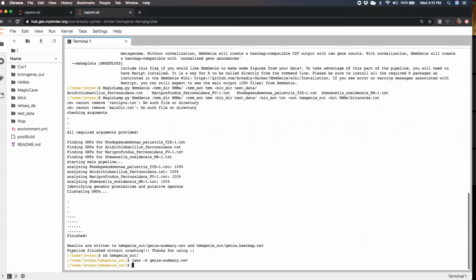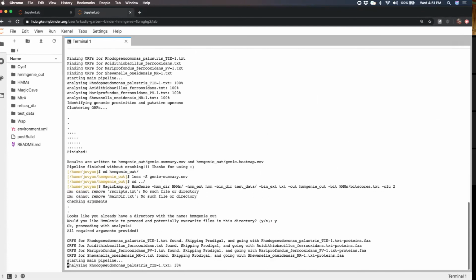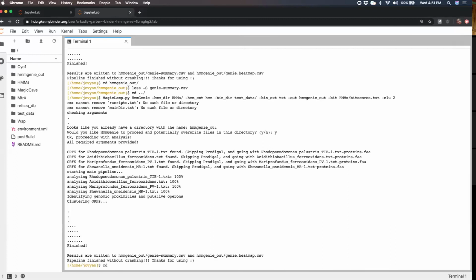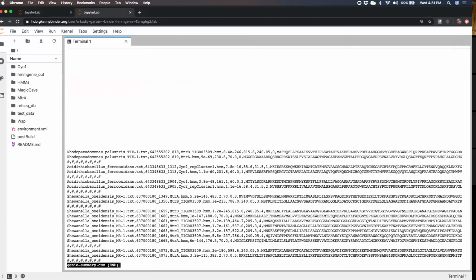So one of the ways that we can filter them out is we could rerun the command, and then we can add -clu 2. There it goes. So it's going to run. The output. And as you can see, we got rid of the other cytochromes, periplasmic cytochromes, and we just have Cyc1 that's involved in the gene cluster with Cyc2. Okay, hopefully that's clear.